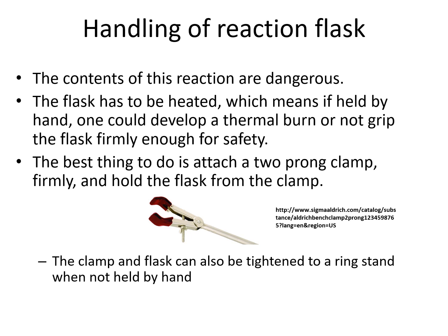It doesn't put out any smell, and especially some students may forget that the glassware is being heated, or they want to check how hot it is, and then later they find it very hot, because it's just glass, and it's hard to tell how hot it is unless you touch it. But please don't do that in the lab.